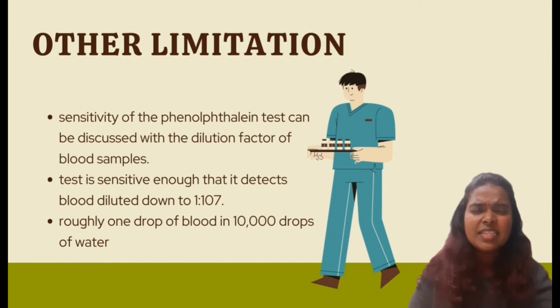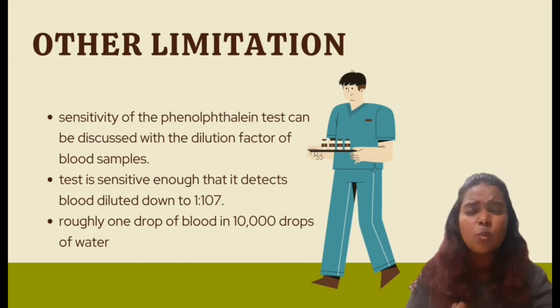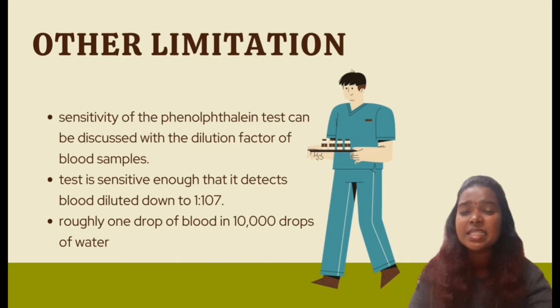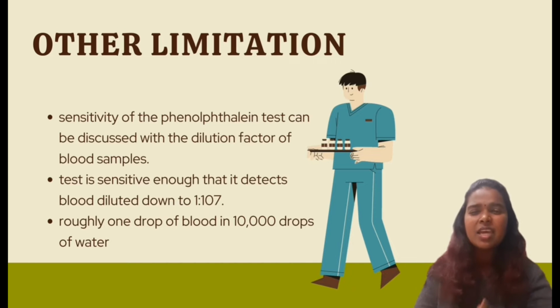The original test uses a swab damp with water. Treating the swab with ethanol lyses the cells and improves the sensitivity of the test. Theoretically the test is non-destructive, meaning you can use the blood on the swab for further analysis. However, the sodium hydroxide solution actually does degrade the DNA. The usual practice is to take a separate blood sample for analysis if possible.